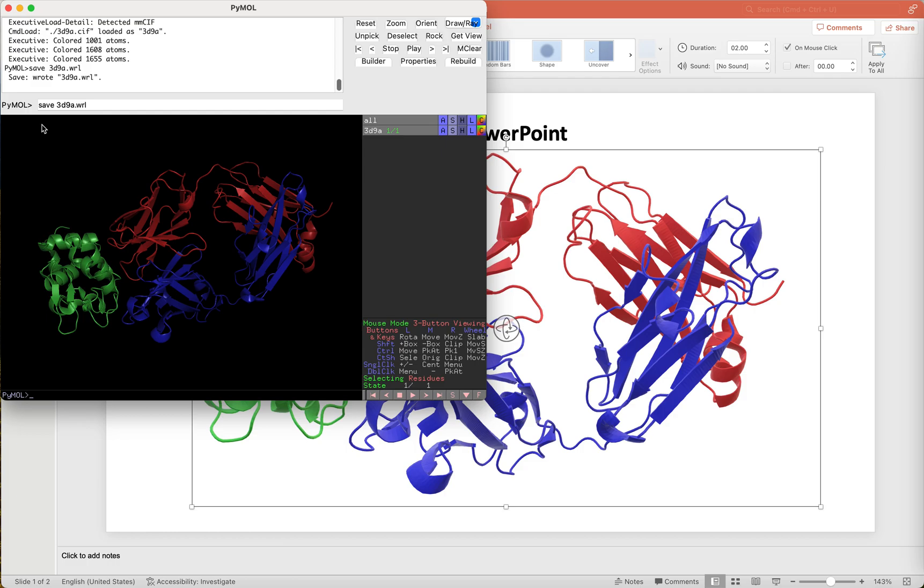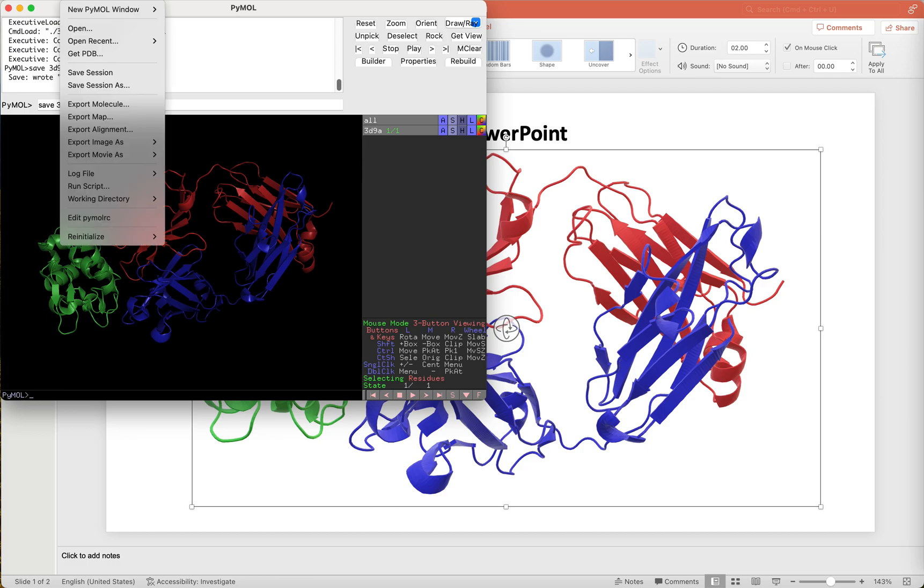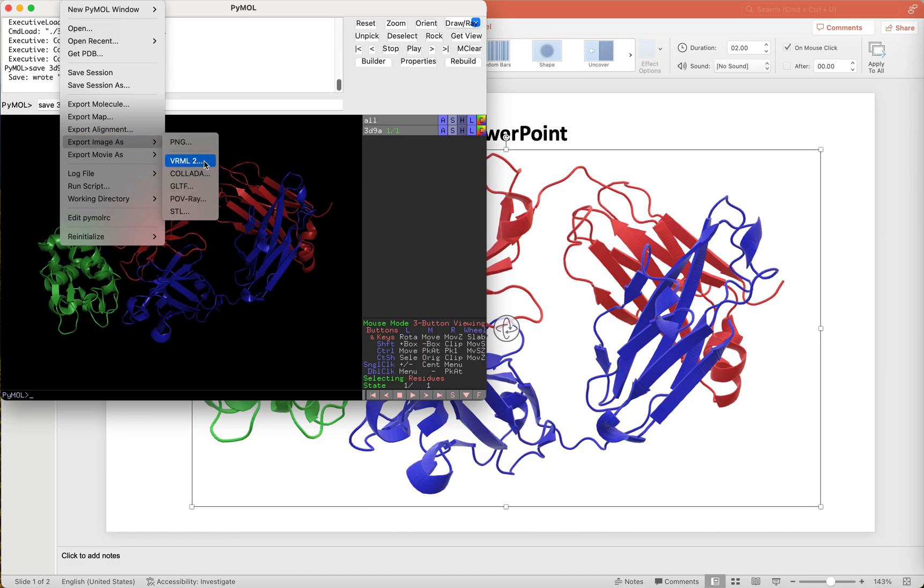Then save a three-dimensional object file by typing save filename.wrl, or choose File, Export Image As, and choose VRML2 file format.